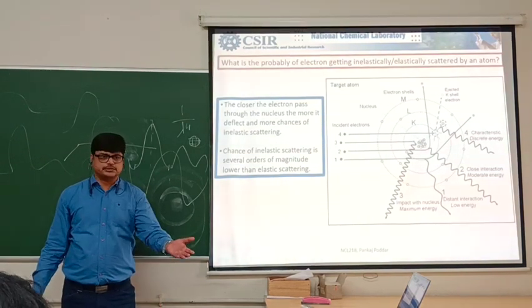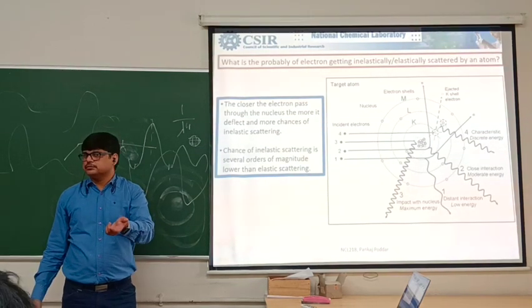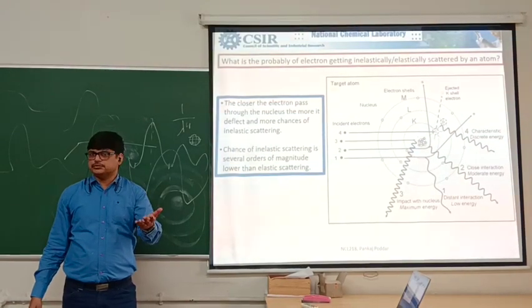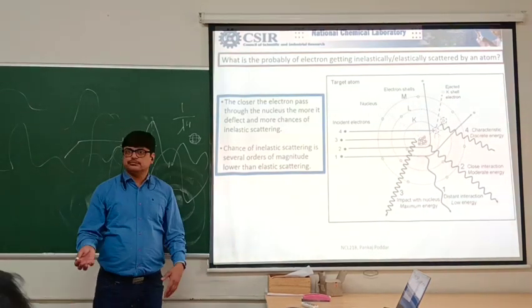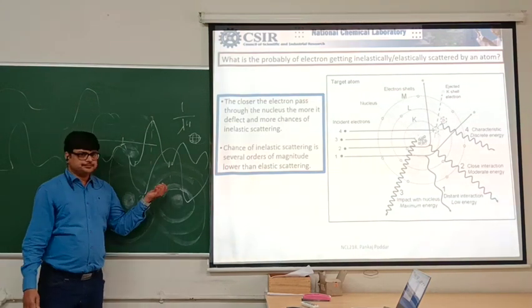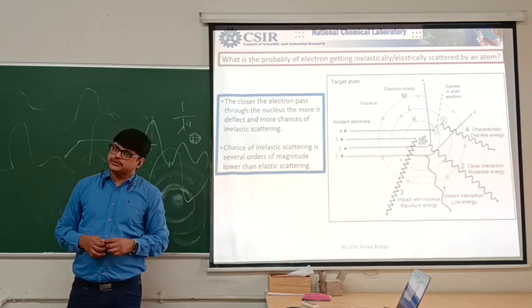We explained in the first class, right? In the first class, the electron interaction is proportional to the Z. So I explained that organic matter doesn't scatter many electrons, right? That we covered, but we will be covering it again. Don't worry about it. So that's the reason that we don't have a charging issue in the TEM.